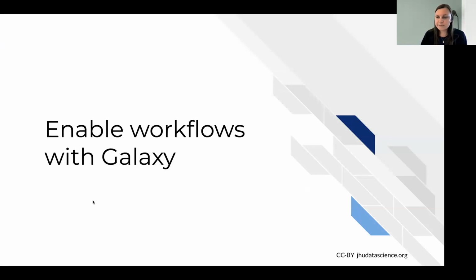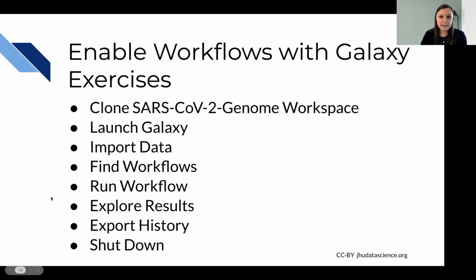So the steps that are going to be part of that are in AnVIL, we'll find the workspace that has this data and has some of this background information that I've shared. From there, I'm going to launch Galaxy and bring data into that environment. We're going to explore workflows a little bit and run the workflow that's been prepared for this analysis to be able to explore the results, export our history back into the workspace, and shut that down to prevent incurring any additional costs.